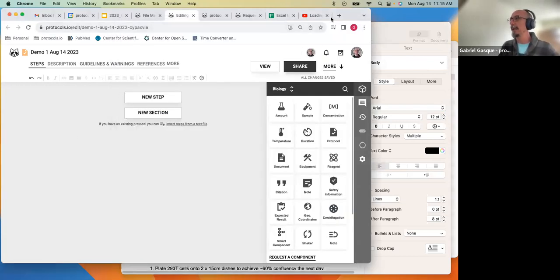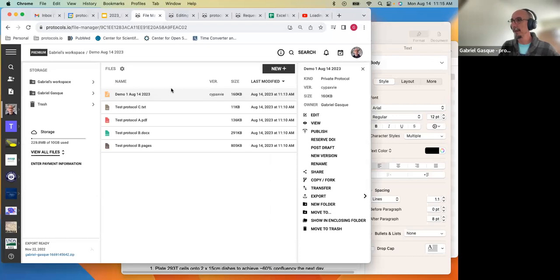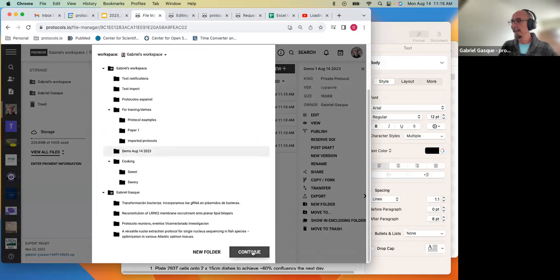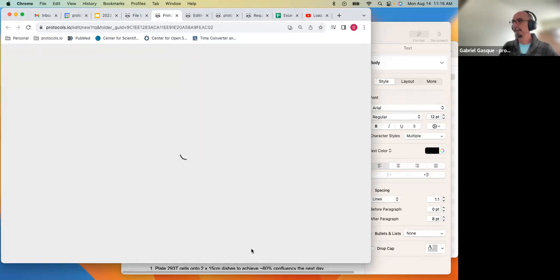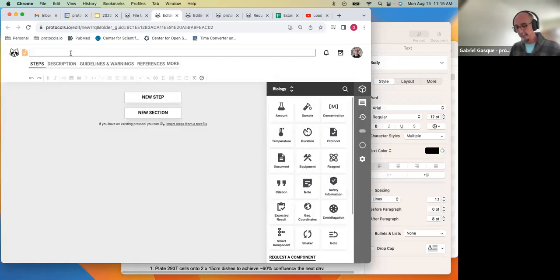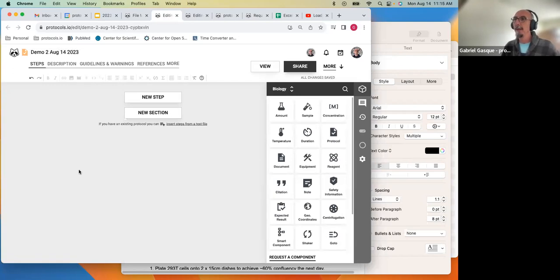So I'm going to create a new protocol. And I'm going to call it demo 2, August 14, 2023.